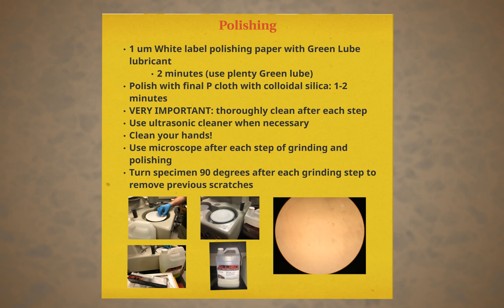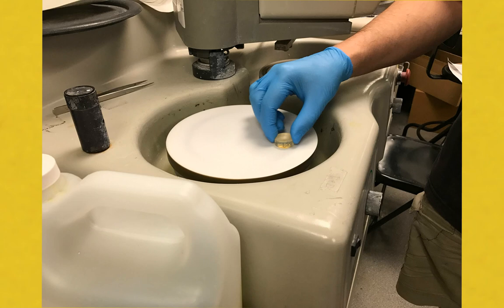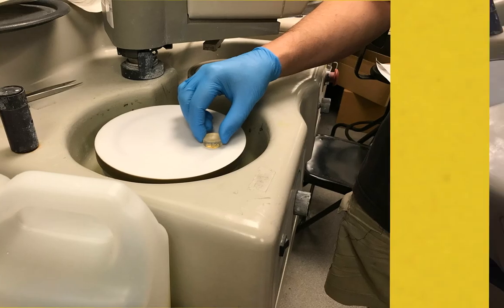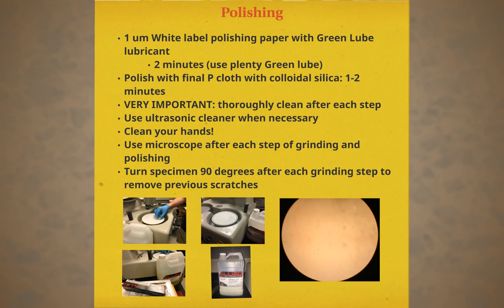Polishing will use much finer grit paper. To eliminate the coarse scratches, very fine 1 micrometer diamond polishing paper with green lube lubricant instead of water must be used for 2 minutes. The final polishing step requires an even finer polishing cloth used in conjunction with colloidal silica for 1 to 2 minutes. It is important to note that at each step in the grinding process the sample needs to be thoroughly cleaned. You should also be turning the sample 90 degrees for each grinding step to remove the previous scratches and ensure that scratches aren't dug deep into the sample. This can be monitored by checking the sample under the microscope between every grinding step.